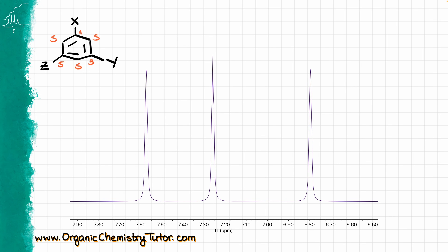I do have to make a small disclaimer: for the purposes of this video, I cherry-picked my spectra to ensure very clean and well-defined patterns. In real life, things are not always going to be as nice and clean. However, within the scope of a regular course, instructors tend to give you cleaner versions of spectra, so you should typically be able to spot those patterns and figure out what's going on.